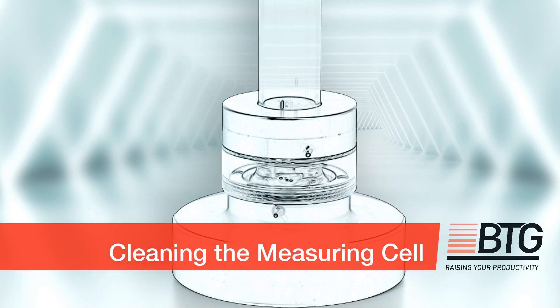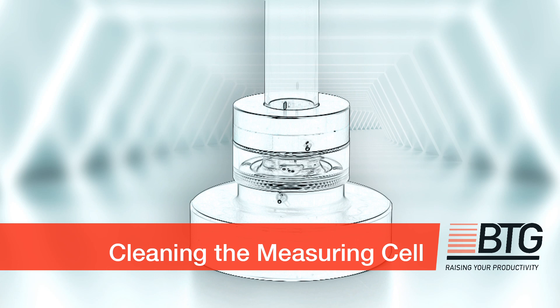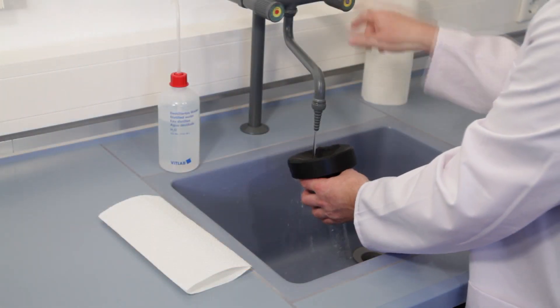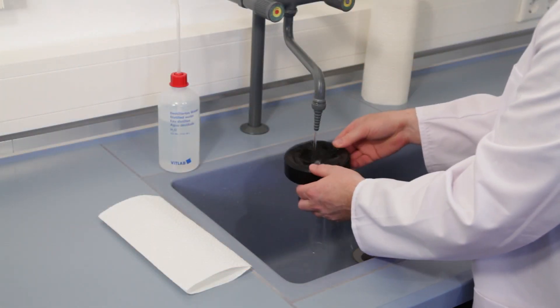In case of slight and non-sticky contamination, it might be sufficient to flush the complete measuring cell under tap water.